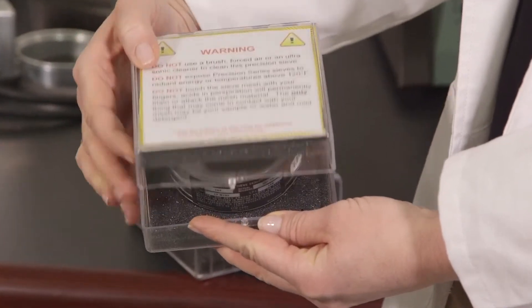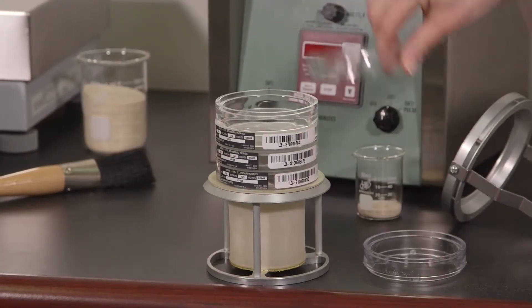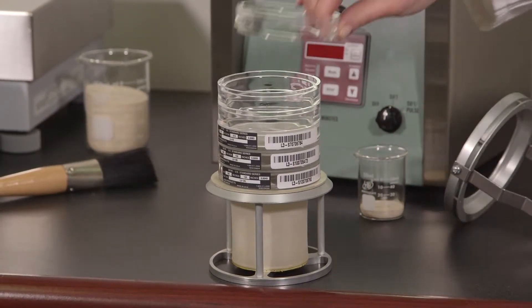For ease of sample viewing, align the sieves so the labels are all on one side. There is room for up to six standard series sieves, or three electroformed.